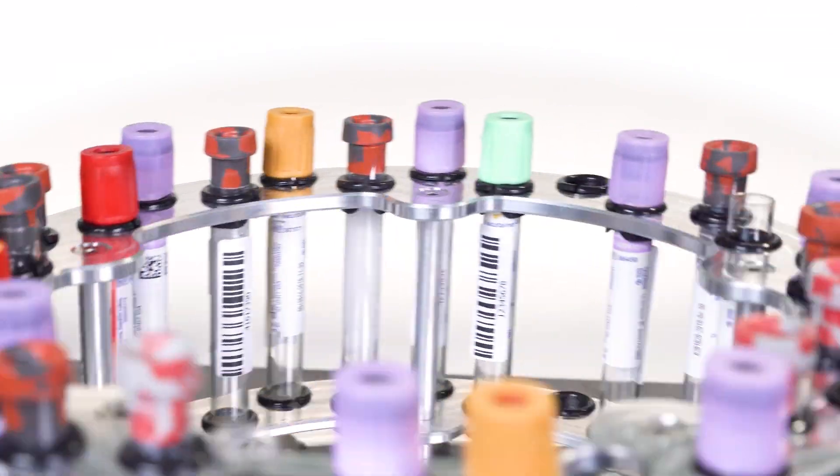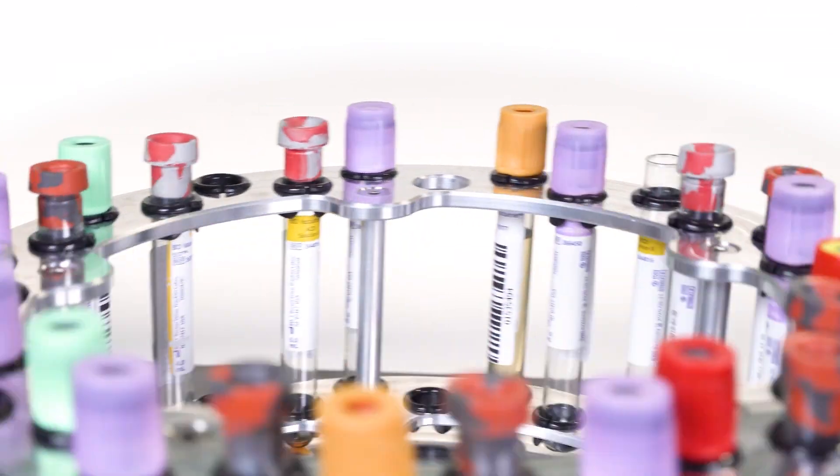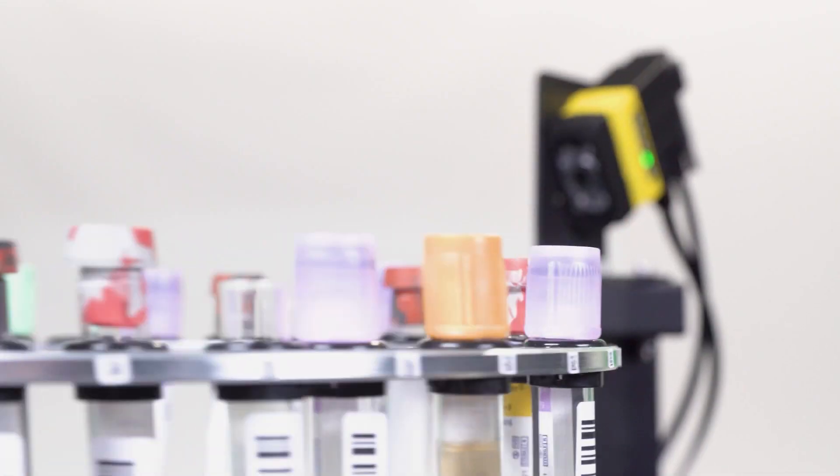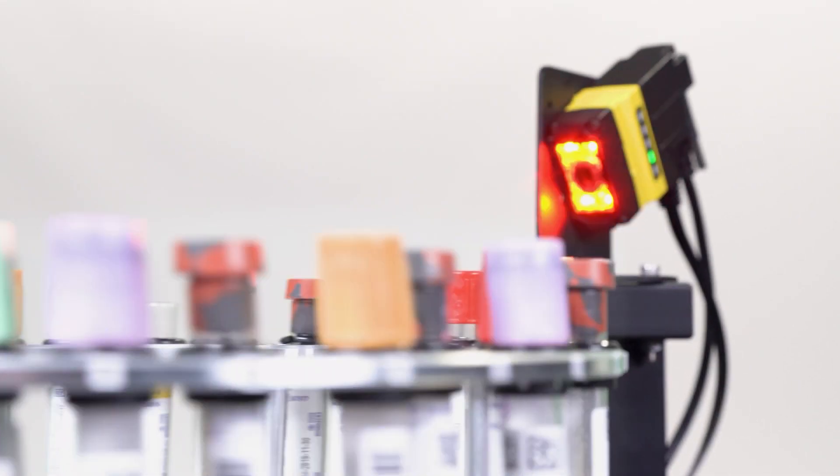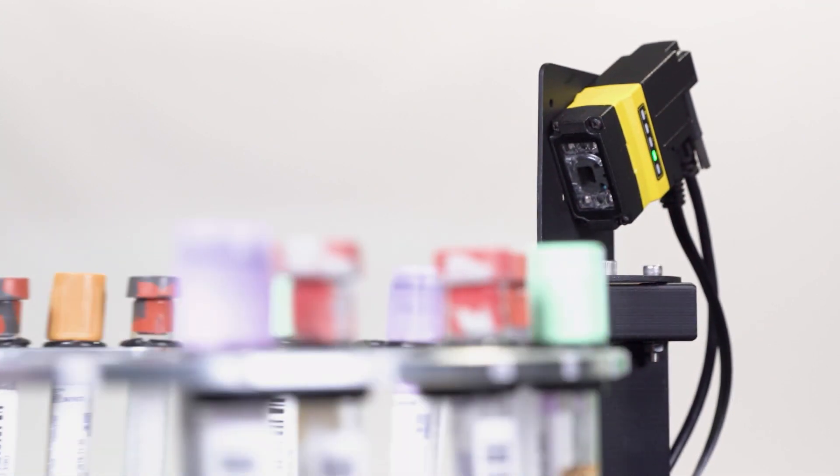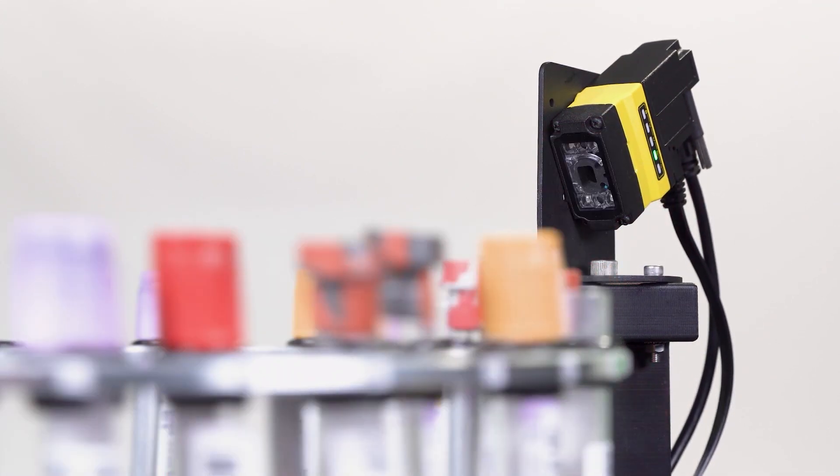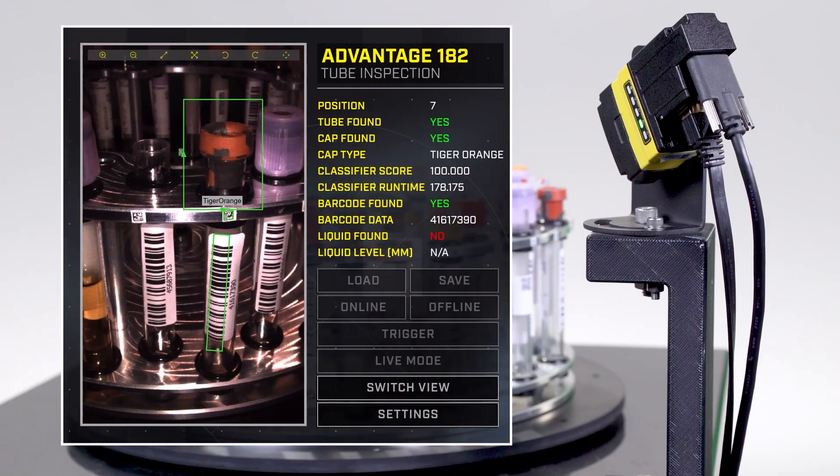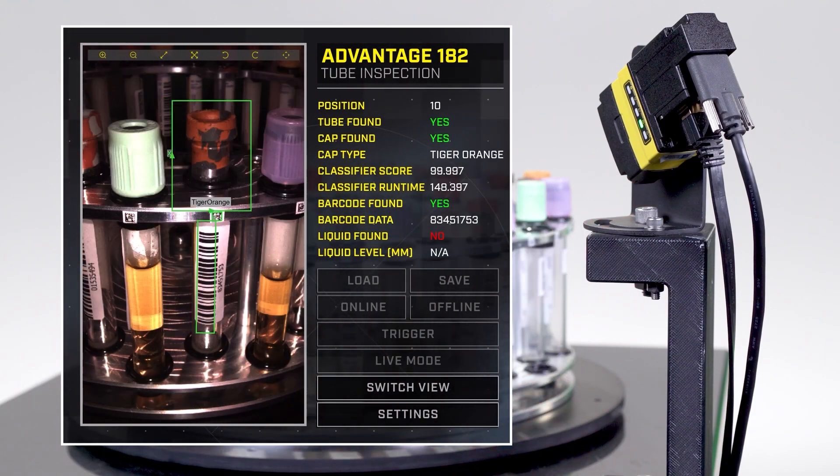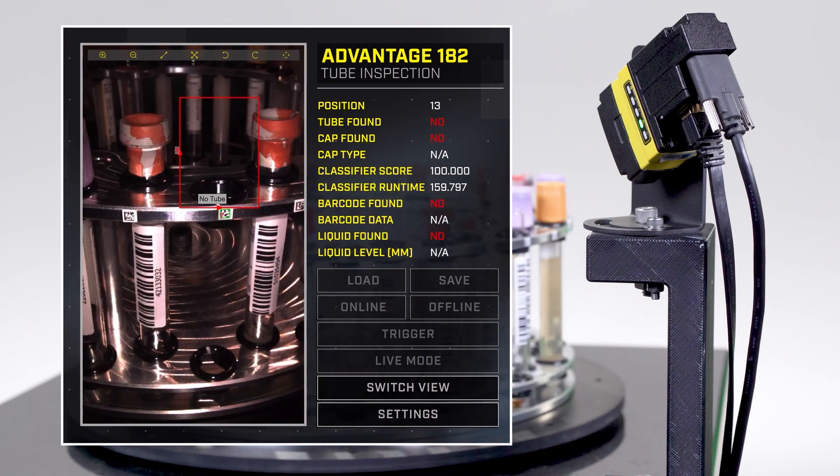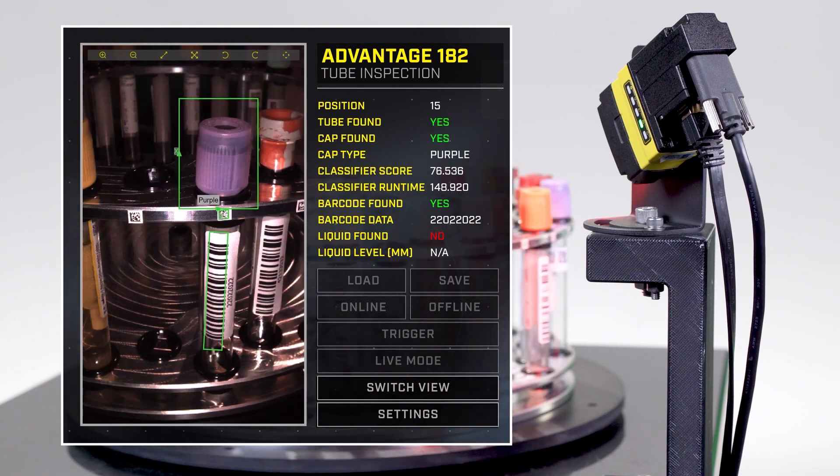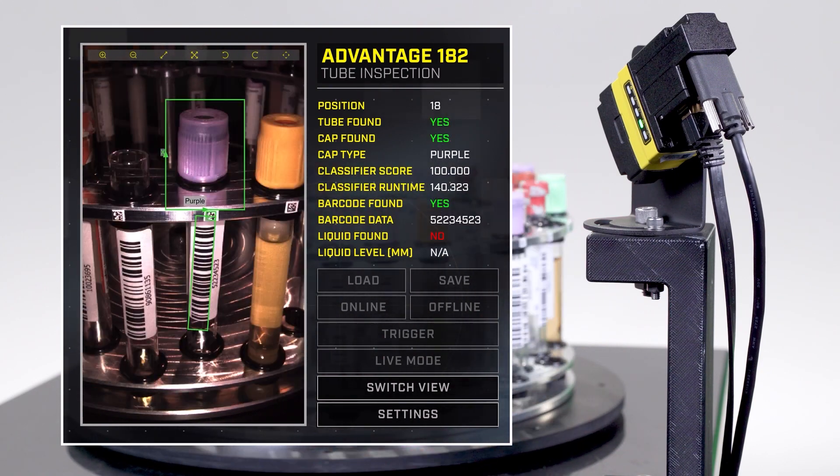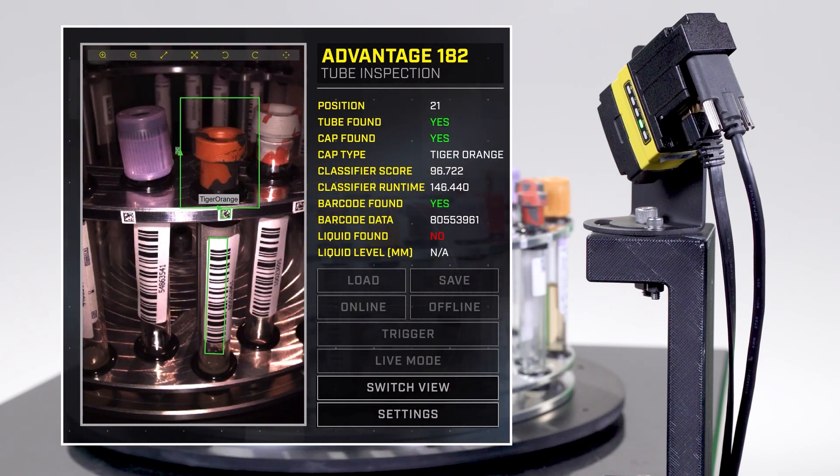Accurately inspecting test tubes and their contents can improve lab efficiencies, safeguard streamline qualities, and streamline operations. With potentially hundreds of samples in a laboratory at a given time, locating and analyzing test tubes can be a daunting task.